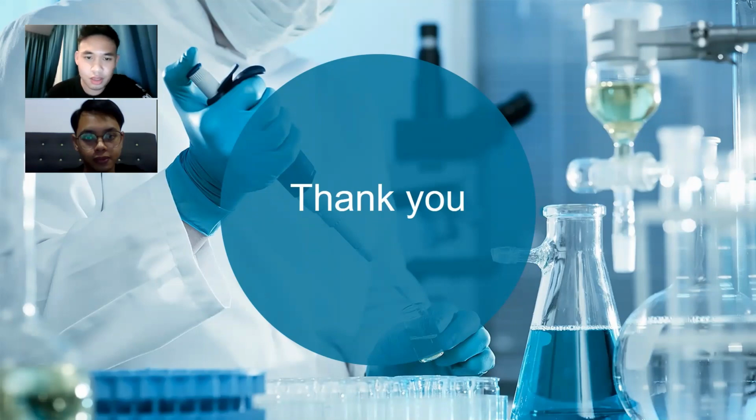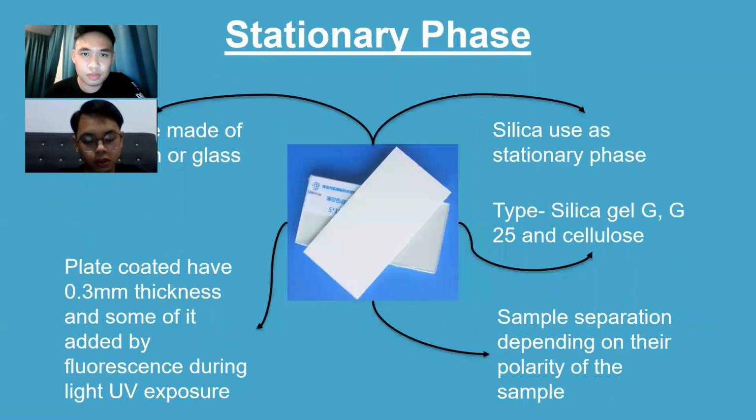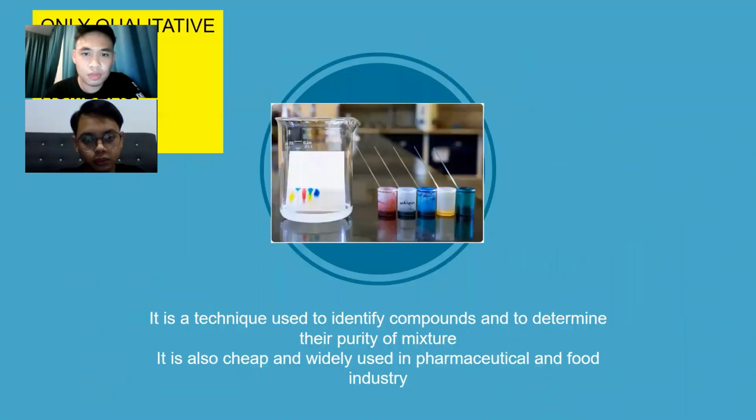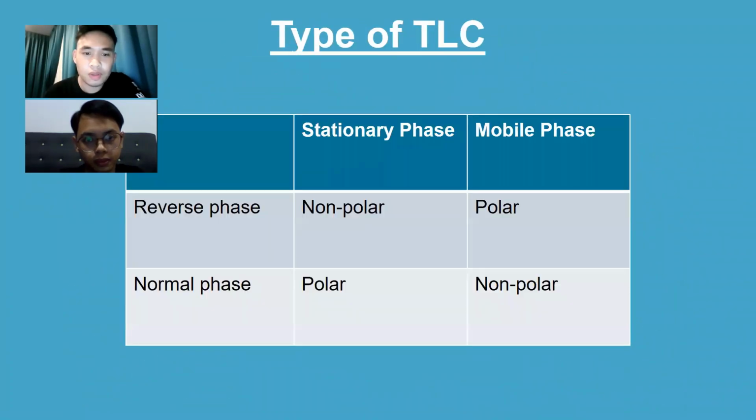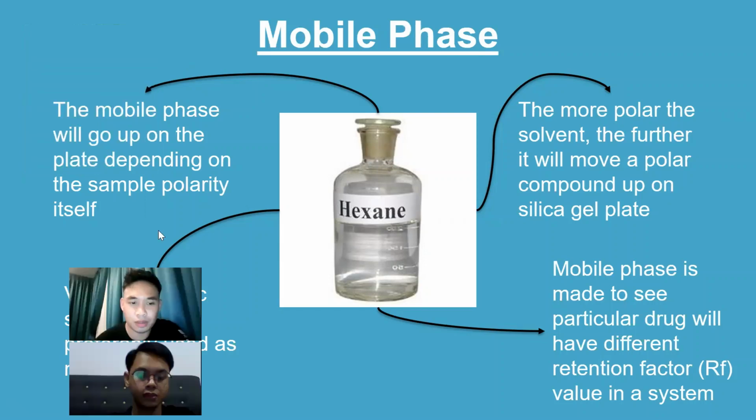Okay, so I will explain about the mobile phase. The mobile phase is the solvent used to travel on the TLC plate.